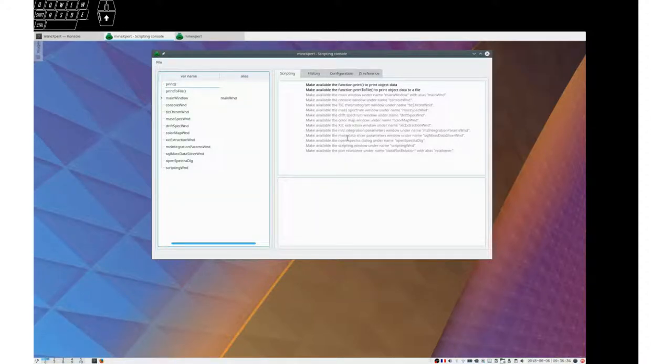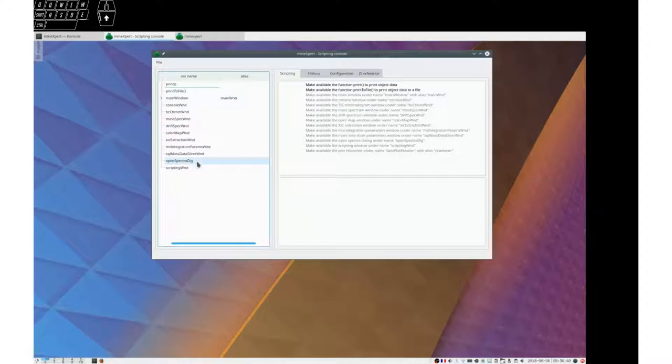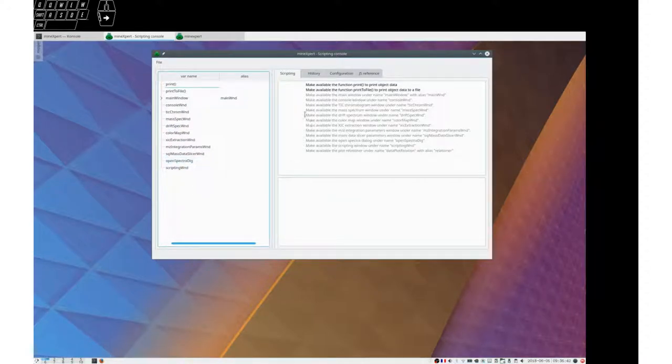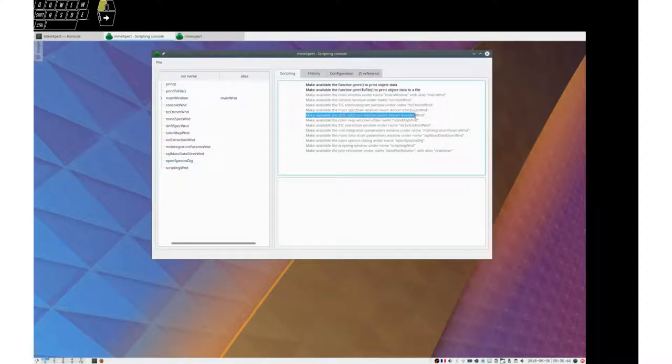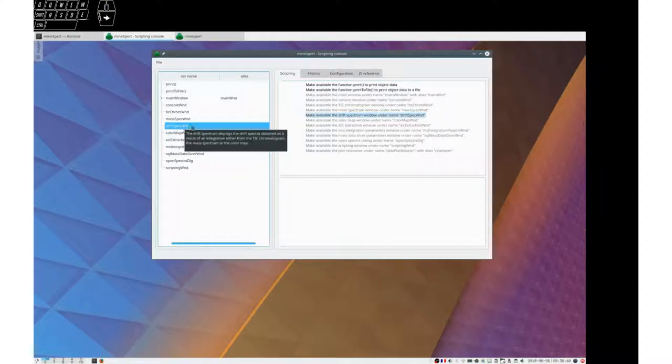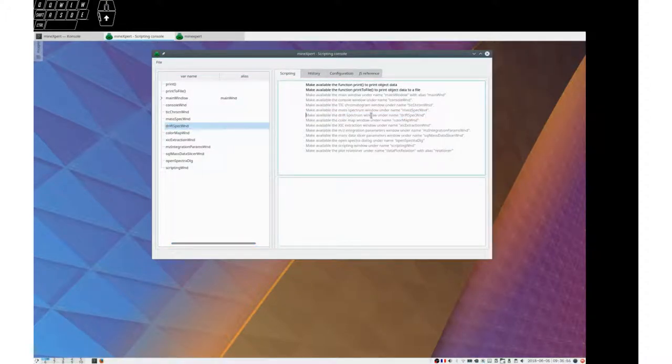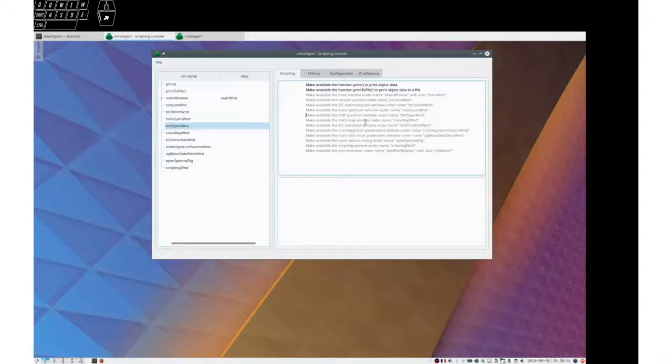When we created the JavaScript objects here, and we added to the TreeView, we wrote a text. For example, this object here is associated to this comment: make available the drift spectrum window under name drift spec window. So this is to document the various objects here.